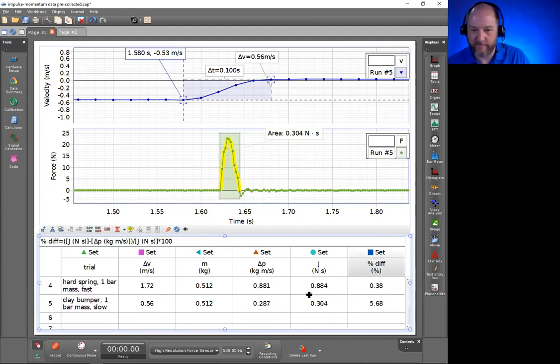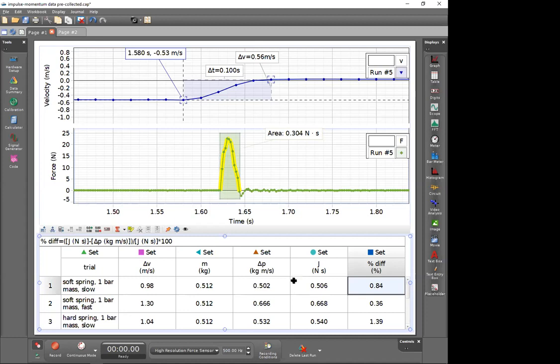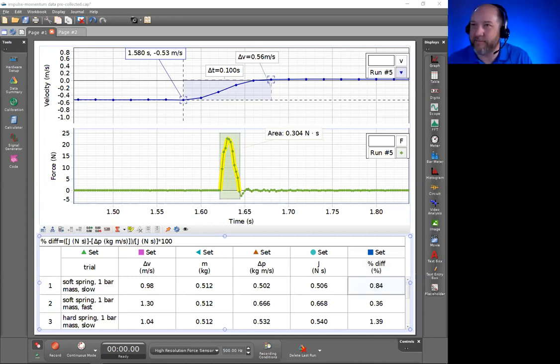All right. So that was a fairly deep dive, especially about being able to collect data and do meta-analysis within Capstone. I want to stop here and ask if there are any questions in the chat or anything we should raise verbally, Jonathan. And then I'm going to wrap this activity up before we jump to the next one by showing you what we can do with this file now that we've collected this data. I think we got the questions covered for right now. Thanks again. Keep the questions coming, and thanks, Jonathan, for managing those.